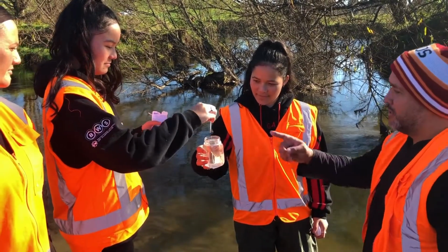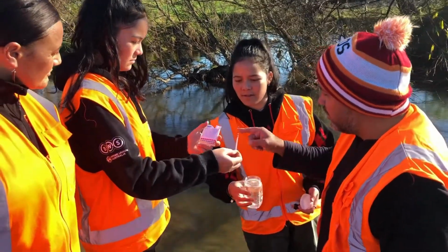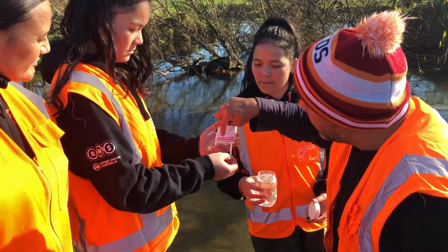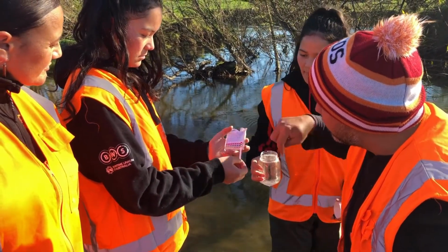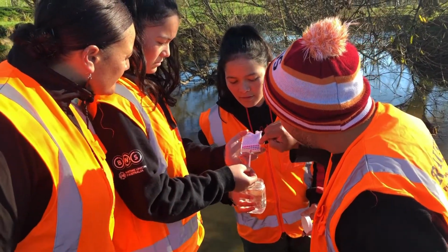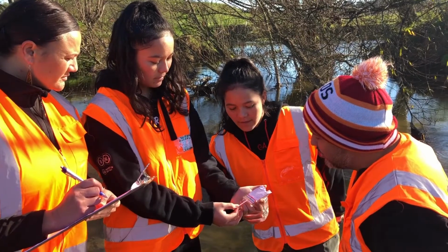Ka pai? Now from that, those strips would have changed colours. Now what we want to do is match those colours to this chart along here and find out which one it is. So what do you reckon that is? 7.5.